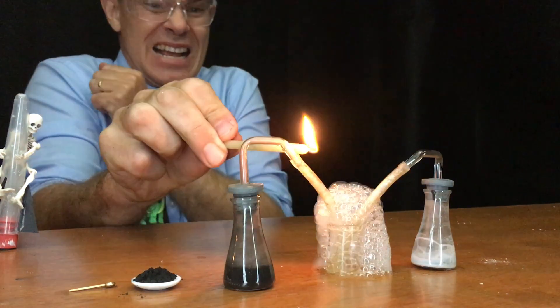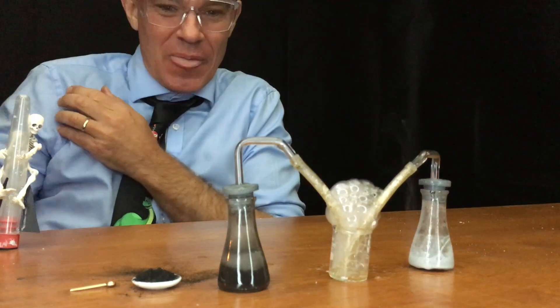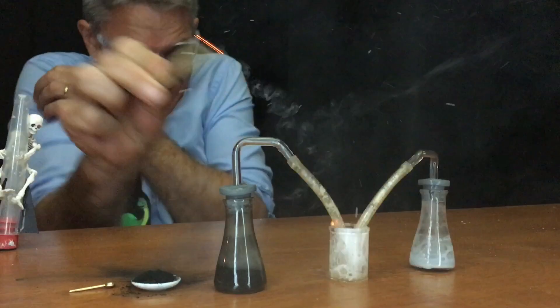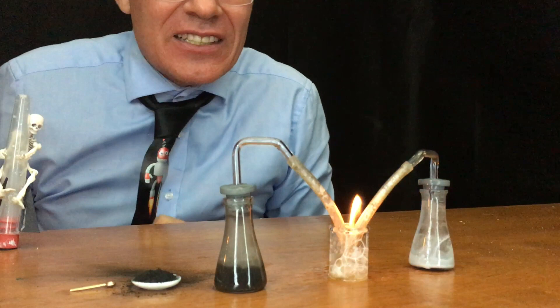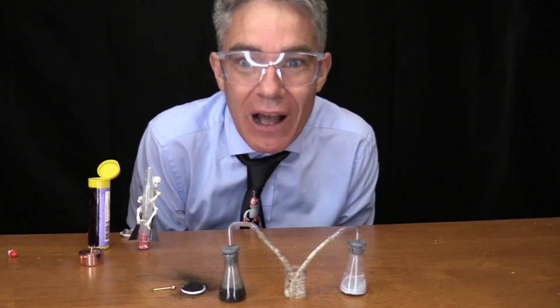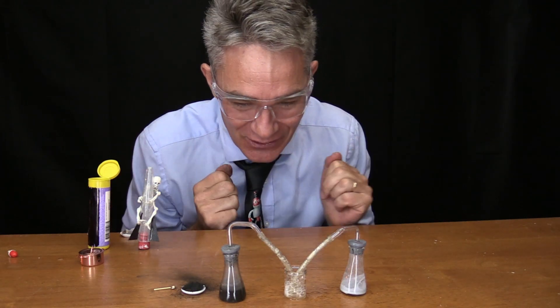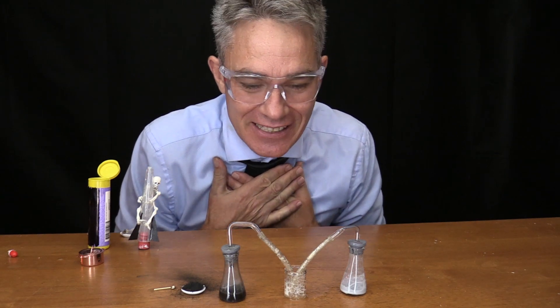Oxygen and acetylene — I'm going to light the two. Whoa! That is explosive, isn't it? That is amazing! Make sure you've got your safety goggles on. Oxygen and acetylene gas — very explosive!